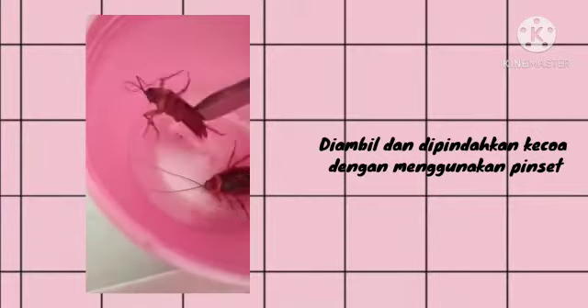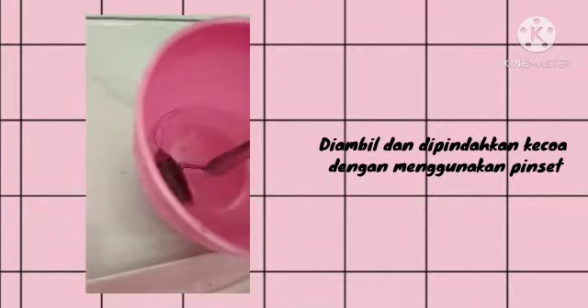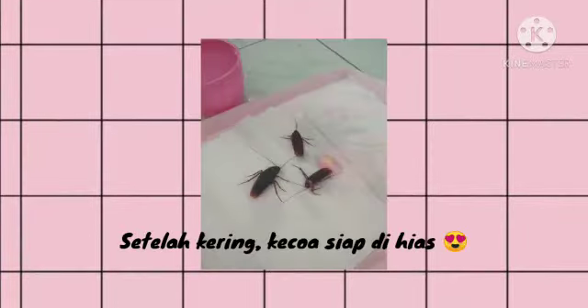We wait for a moment. After all are dead, the cockroach is taken out and moved using tweezers. After that, it is dried for a day under sunlight. After it is dry, the cockroach is ready to be decorated.